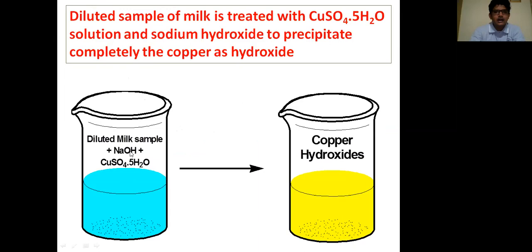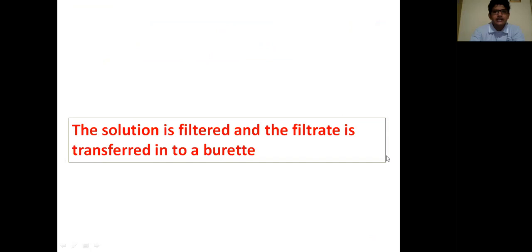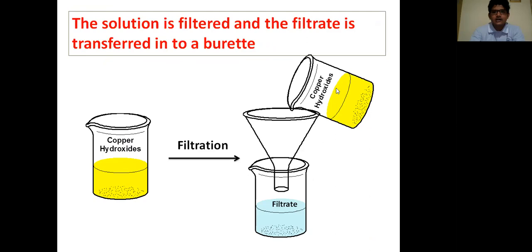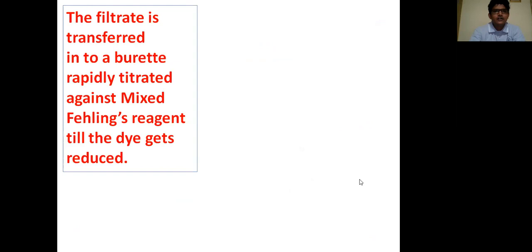Here is a diluted milk sample. In this sample we add NaOH solution and copper sulfate solution. When we add NaOH, all the copper will precipitate as copper hydroxide. Then the solution is filtered and the filtrate is transferred into a burette and taken for titration.